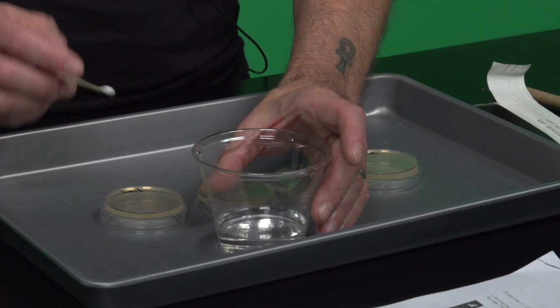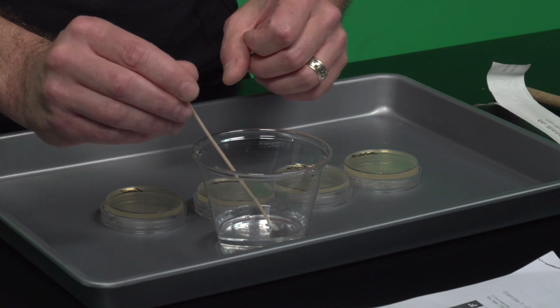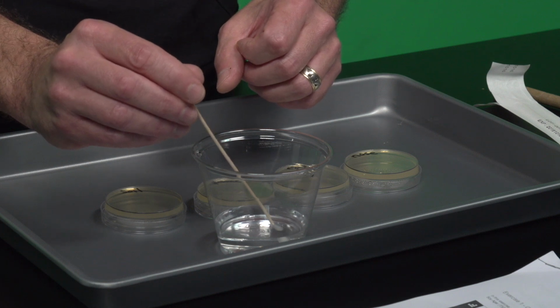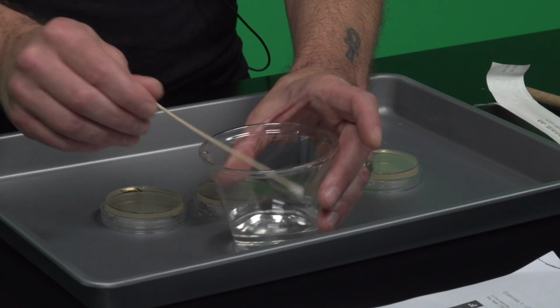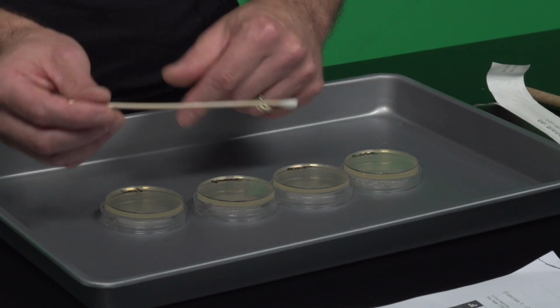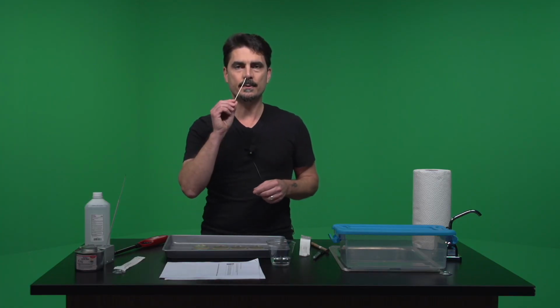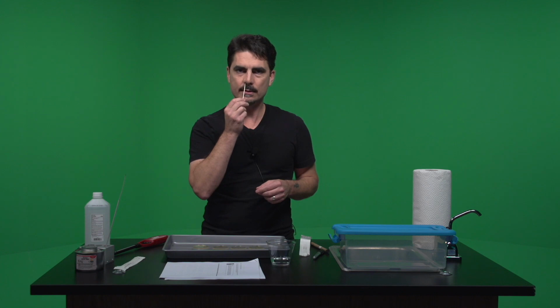I'm going to put this in the distilled water that I just poured. The reason we're using distilled water is because there's going to be very, very low microbial load, so that ideally whatever you see on your plates came from where you're sampling. The purpose of the water is just to get this swab moistened. We want a nice moist swab. Now if we go to my nose, I'm going to put it up in there and gently roll it around on the inside. I'm doing it multiple times because of whatever microbes are in there, I want to see.